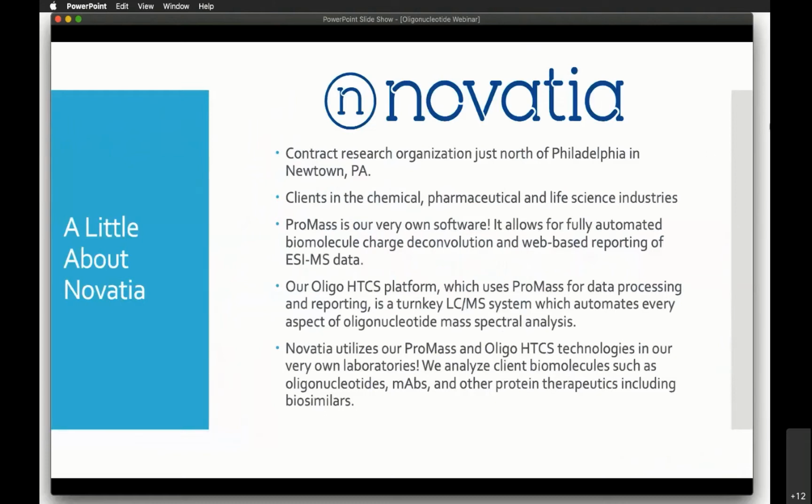For those of you who don't know, which is probably none of you, I think all of you are oligo customers of ours, but we're Novatia. We're a small contract research organization just north of Philly. We've got clients in the chemical, pharmaceutical, and life sciences industries, and you may have heard of ProMass. Hopefully you've heard of ProMass before.